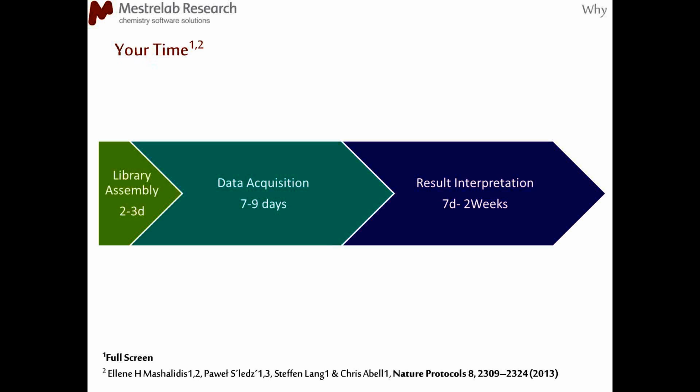This is a representation that I came up with of what a setup for screening can take you, once you know, obviously, very well what you would like to do. And interpretation of results, it always takes a hit. Interpretation of results sometimes may take as long as any of the other 2 steps. So I always thought that it would be natural to try to decrease the interpretation of results as much as possible, given today's state-of-the-art technology.